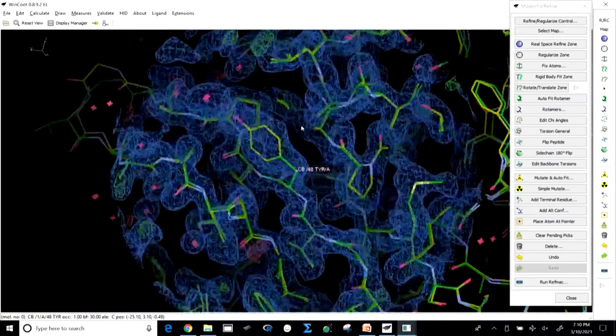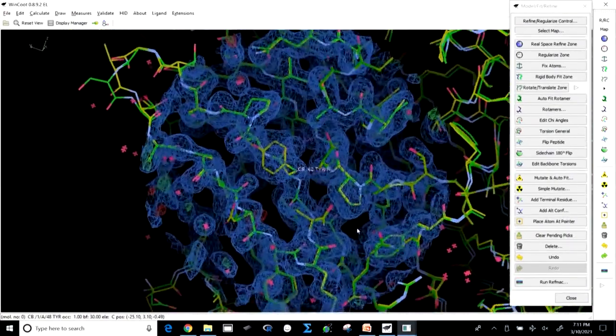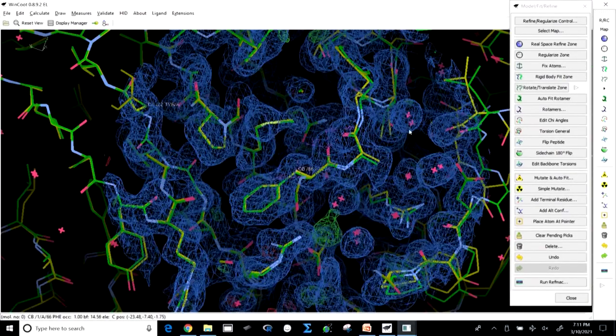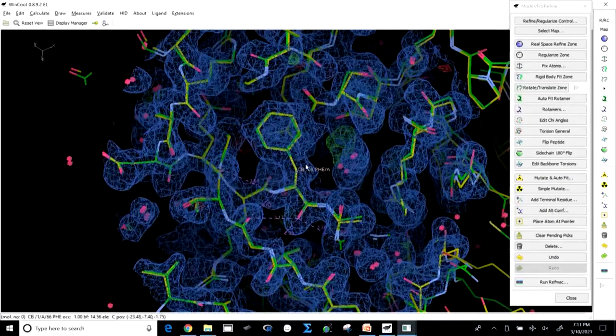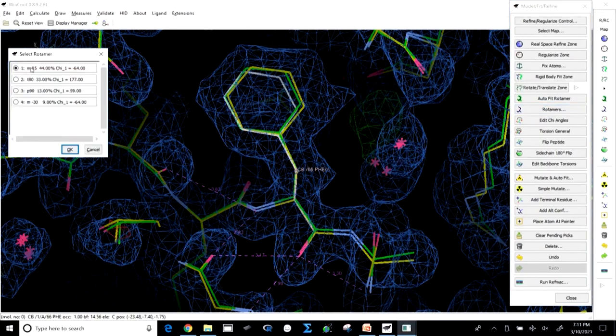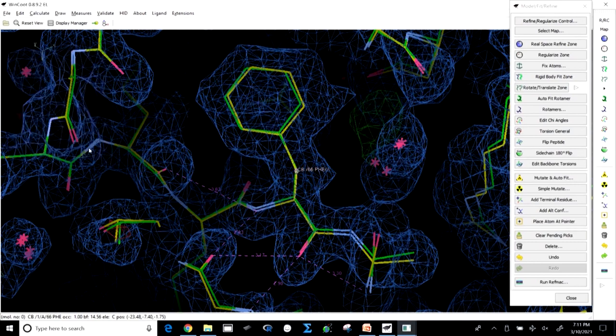What else could we do? We could show how you could use a rotamer. As this is here, if you want to get the other rotamers, you will get 1, 2, 3, 4, 4 different conformations of the rotamer. We do not include it.